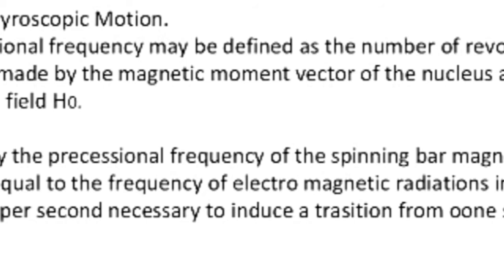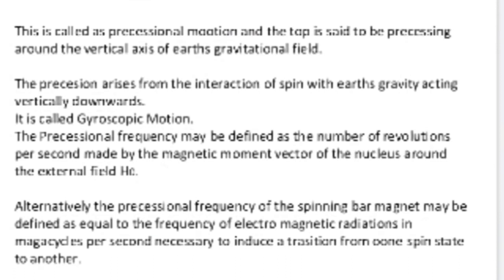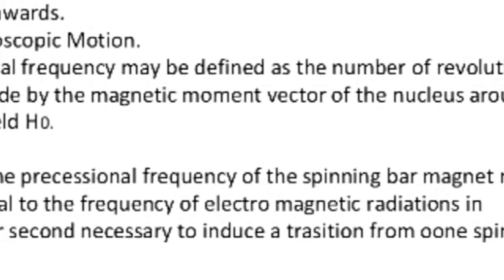So here both definitions are there: gyroscopic motion, precessional motion, and also precessional frequency.